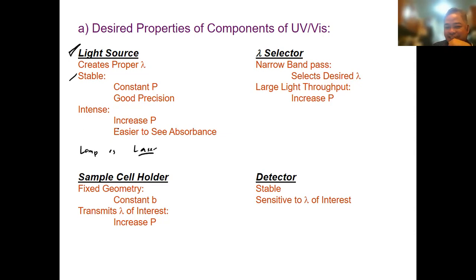If your light source is a laser, you have to be very careful. It's so powerful. I think I destroyed one detector before. It's my first time to use a laser. Sunog yung PDA. Nagtaka kami, ang taas ng signal, tapos biglang 0. And then it's just 0. So tinanong ng professor, what happened? Why did you get the new guy? Ako yung new guy.